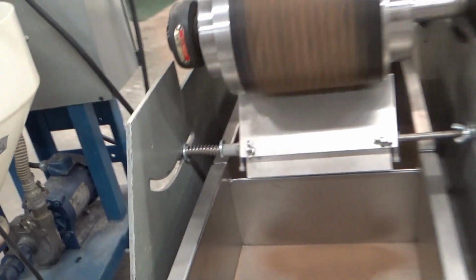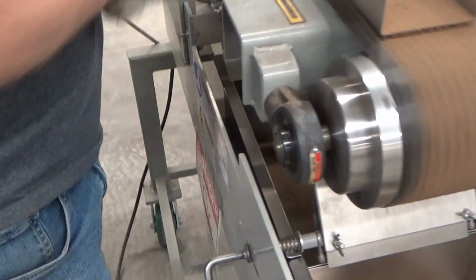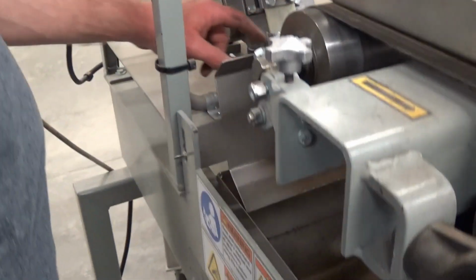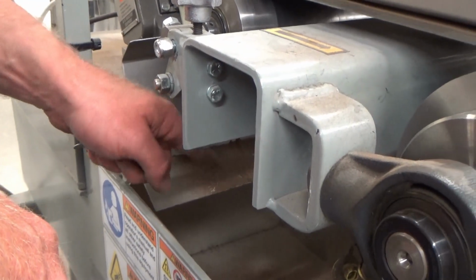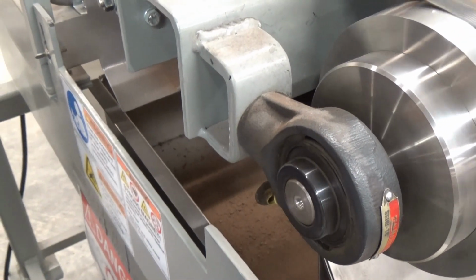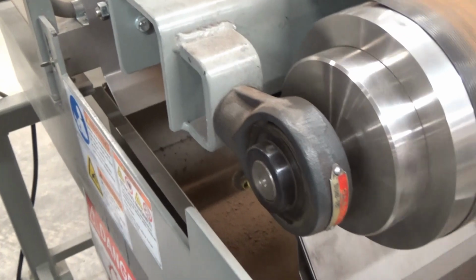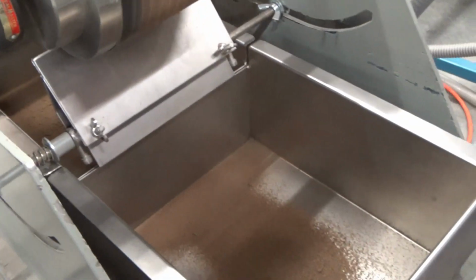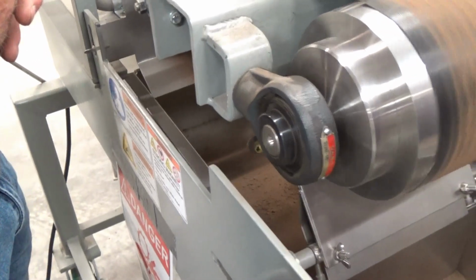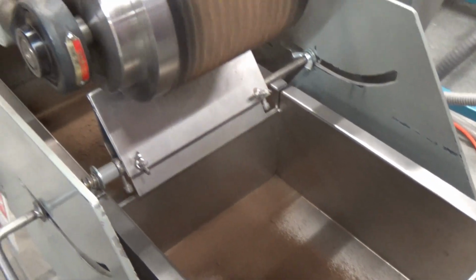You can see it's hanging on too long and getting carried out over this end stop. Okay. There's some dust here. Yeah. Now it's mostly just catching there or dropping before it. Yeah. Slower's better, right off. Small particles. And it's still bringing a lot of clumps there. There must be some pretty magnetic material in there, huh?